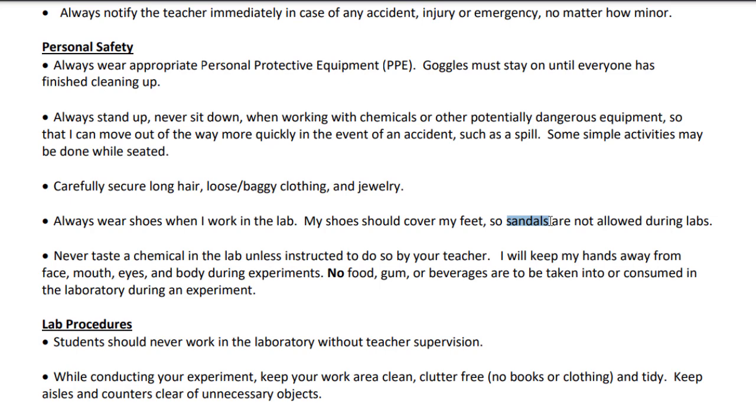So don't be doing that during a lab day. Any other day, no problem. But lab days, you have to have your entire top of your foot covered. So running shoes are going to be your best bet for that.